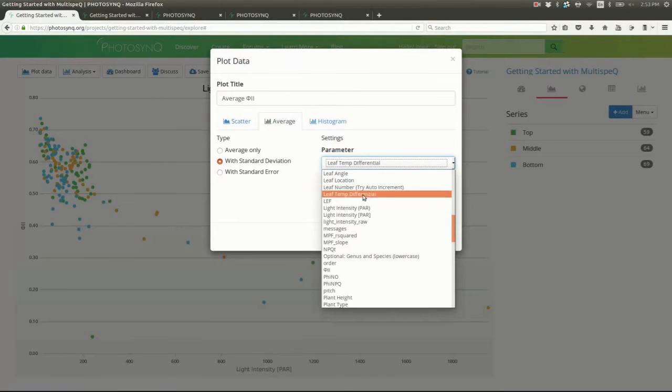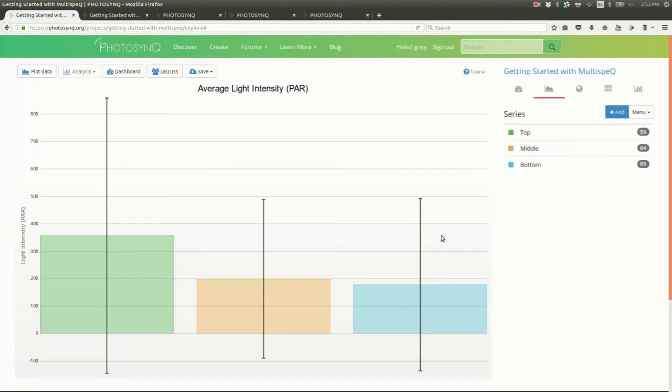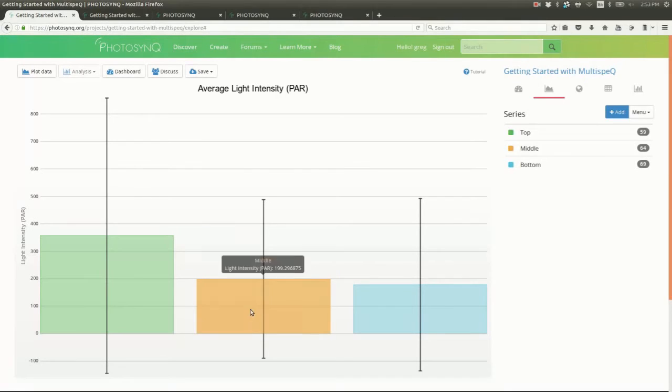Start with light intensity. Leaves on the bottom of the plant see less light. That makes sense.